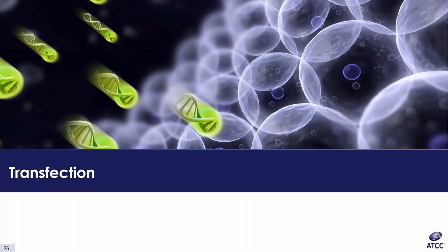Okay, we're going to switch gears again and talk a little bit about transfections and what transfection reagents you can use.